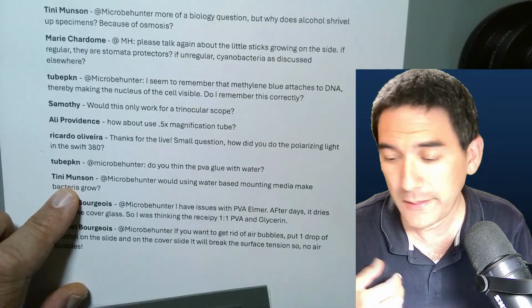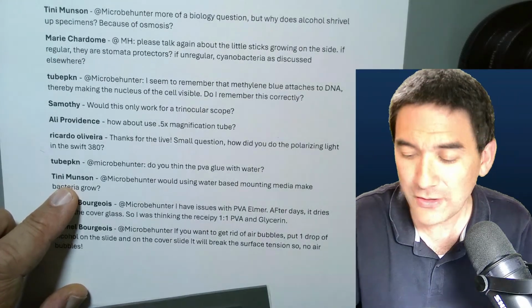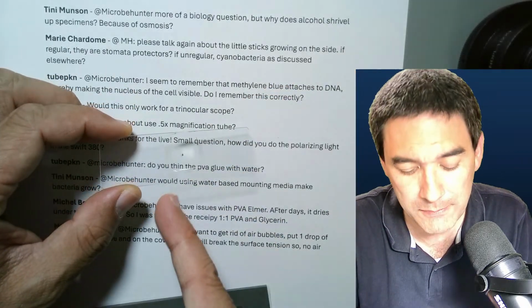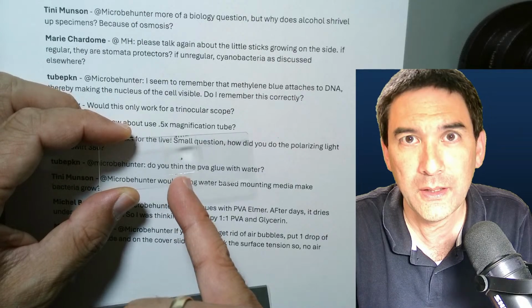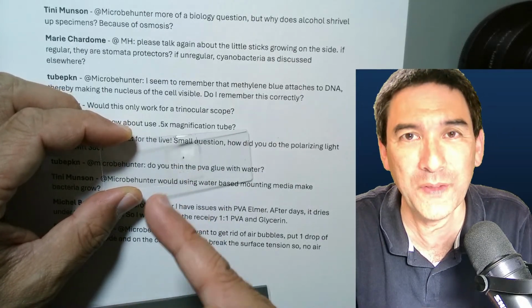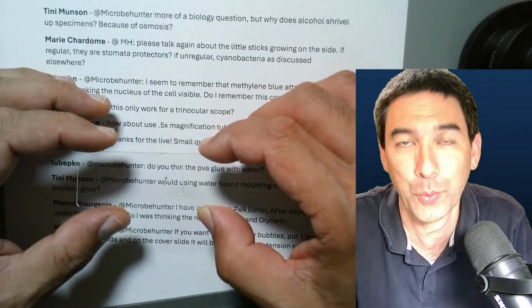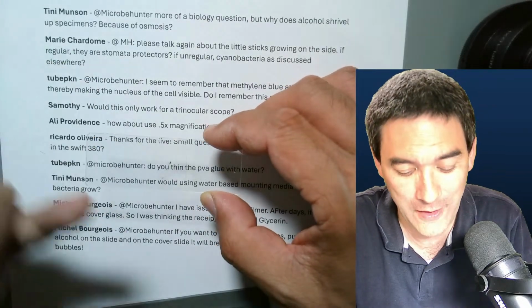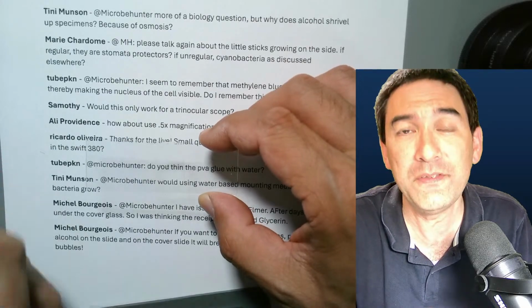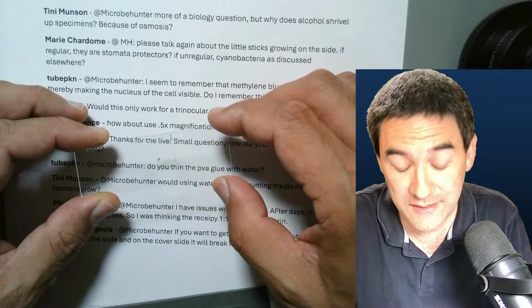So for example, I don't have a slide here right now, but let's say I've just made this one over here, and for whatever reason bacteria were to grow in here. Then they are going to decompose the specimen, which is something bad. You don't want that. Decomposition is a fancy word for rotting. If the specimen is rotting away because bacteria and also fungi break it down, then sometimes you also have decomposition gases forming, for example carbon dioxide or even methane gas. And this can actually happen.